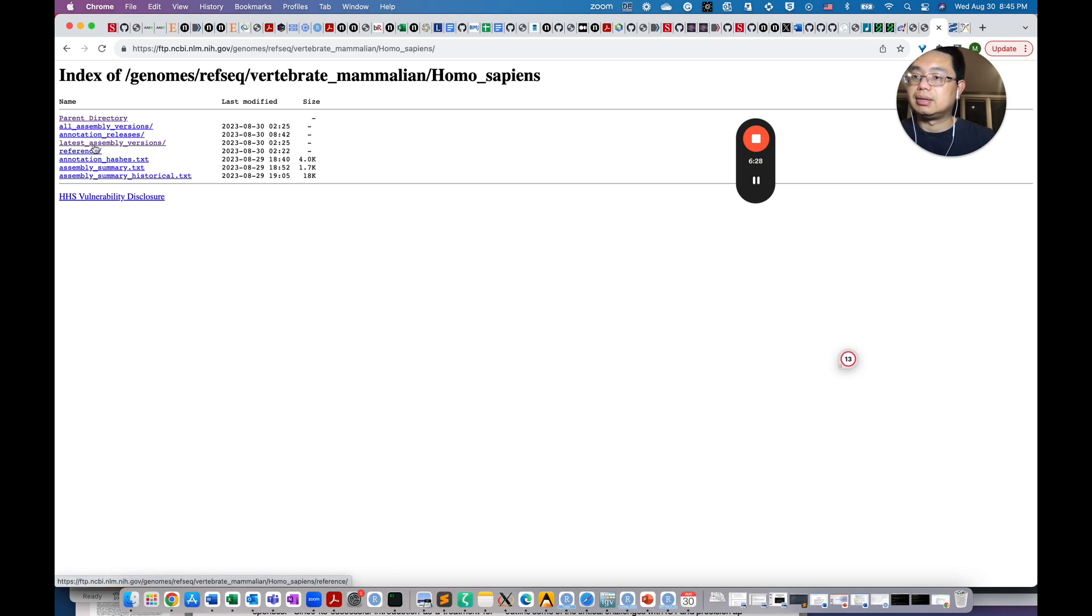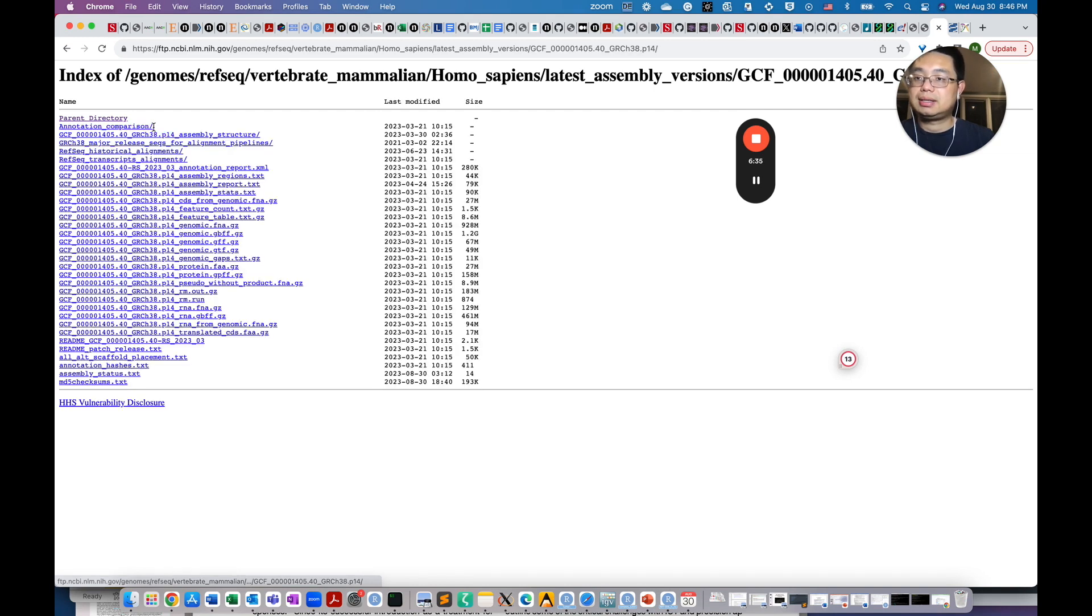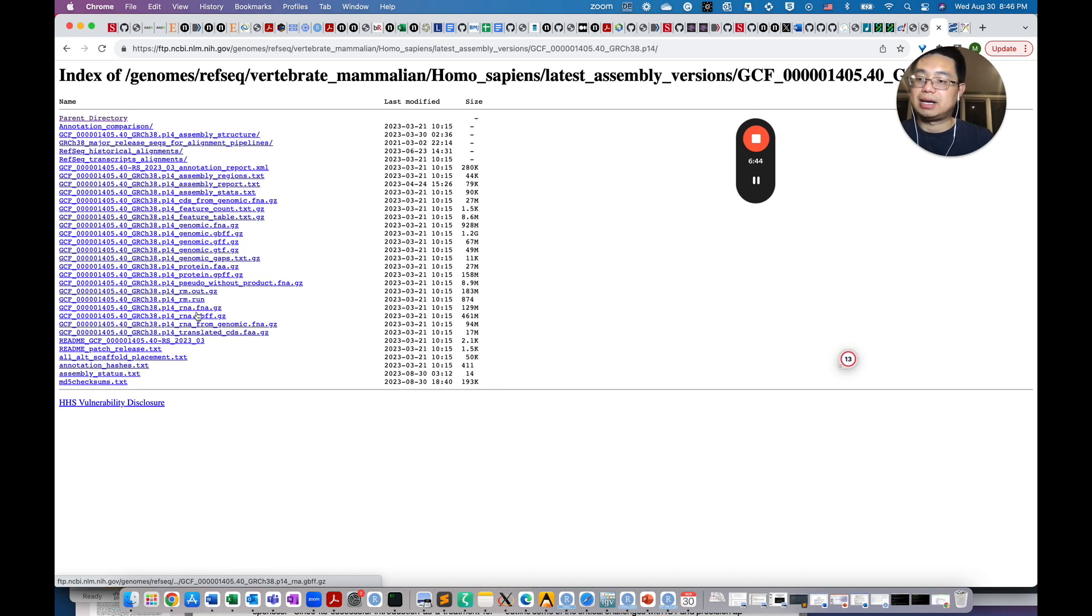Then you can go to the latest assembly version. Again, GRCh38. And you will find the GTF files, the FASTA files, and also the RNA FASTA files. Those are the transcriptome.